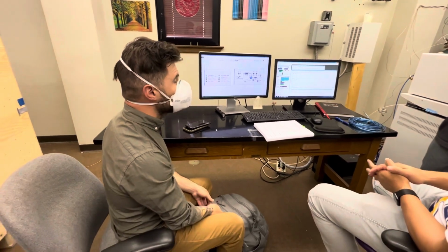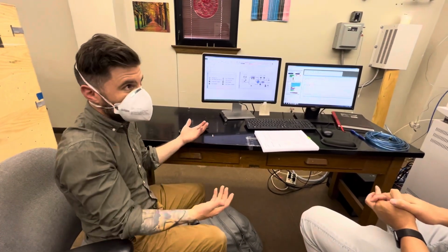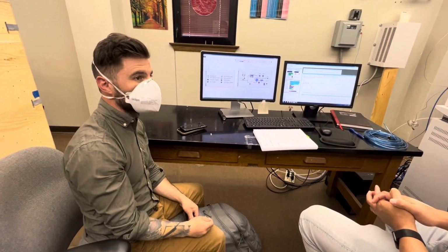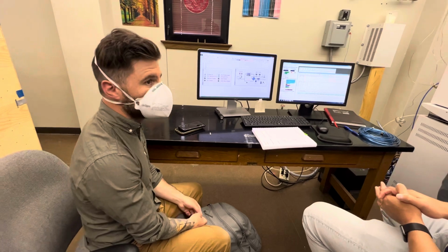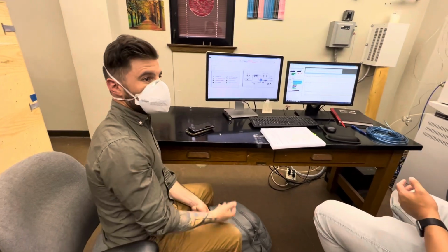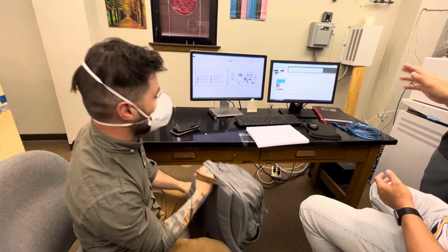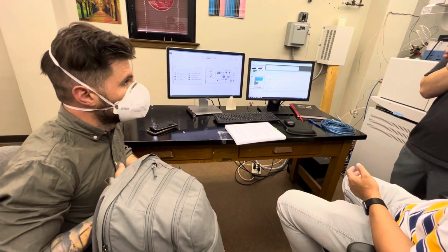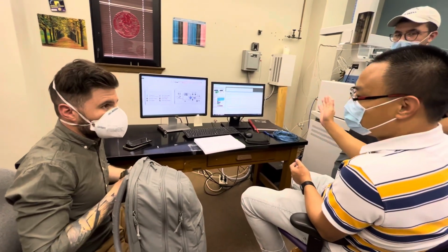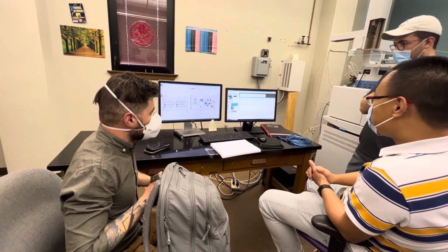So no one sent us samples for 2 years because no one knew how stable the machine is, because it hadn't been running. But after 3 years, okay, we can trust your machine now that you've been running long enough that it's stable. Because sometimes they're not. And why would you pay someone to run your samples if you can't trust the stability of the backgrounds, and also because we run the same standards. The standard data for several years. Yes, the long-term stability of those standards. That's the way to do it.